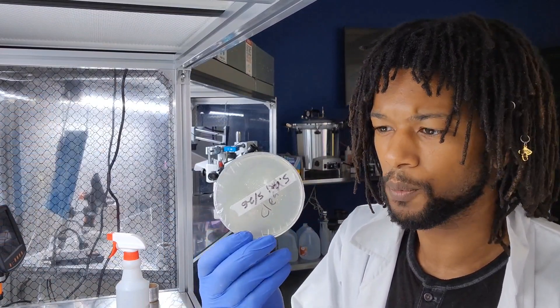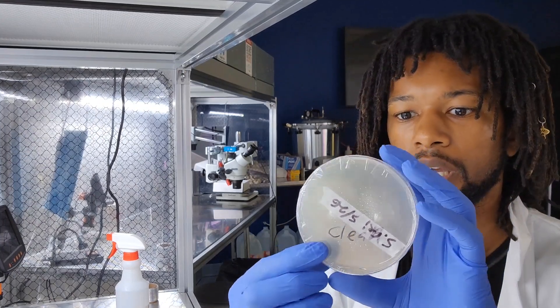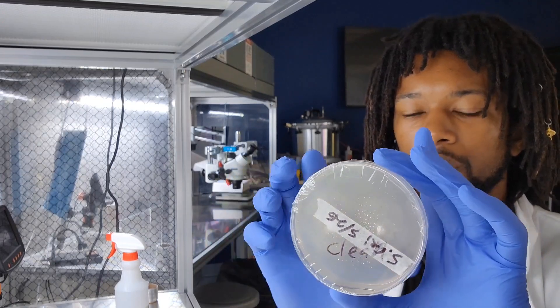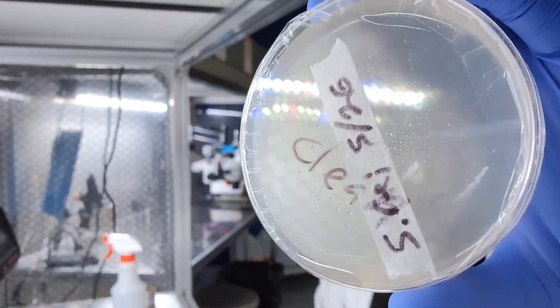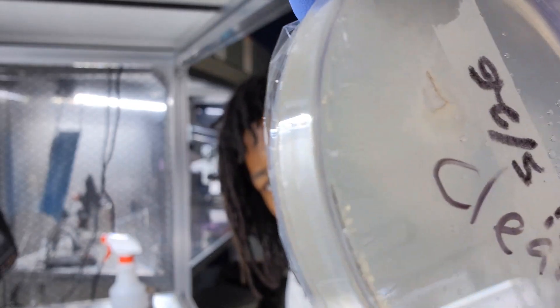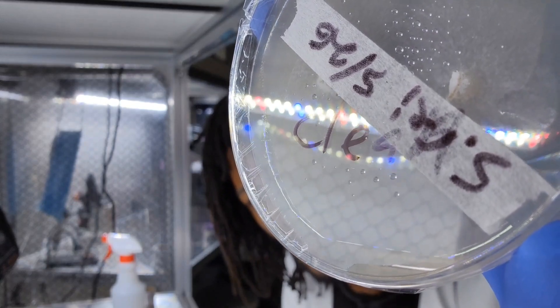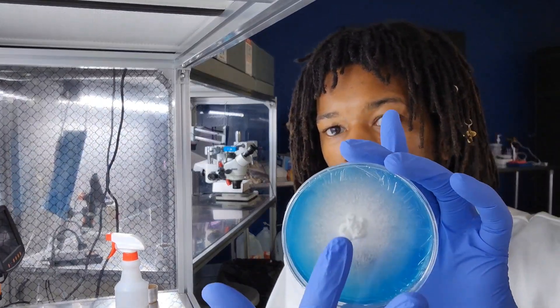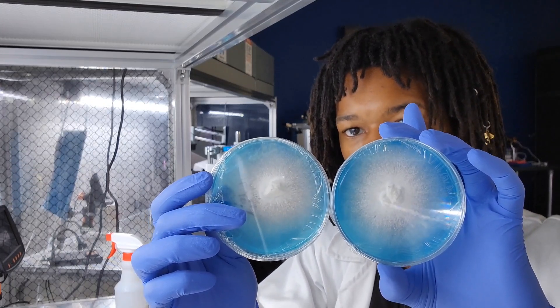I kind of wish I did this one on a blue plate. I inoculated from two points, and they're going to converge together and collect their own nutrients, but then they'll share because they're all the same strain, all the same variety. You can see on one side right there and the other side over there — they're converging together. It looks just like two of these, and if you were to line them up, once they touch they'll just combine together.